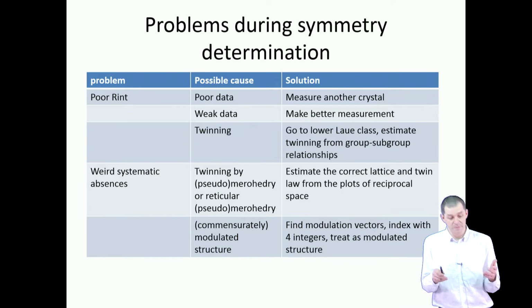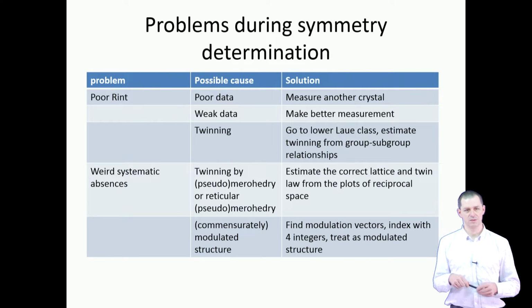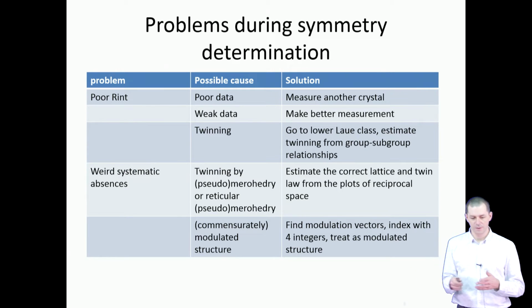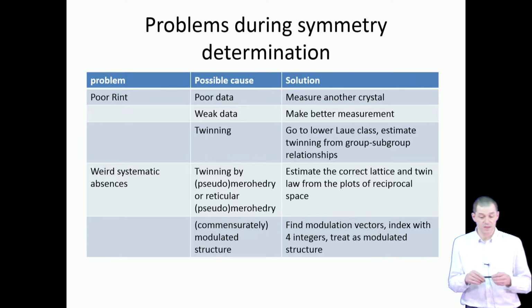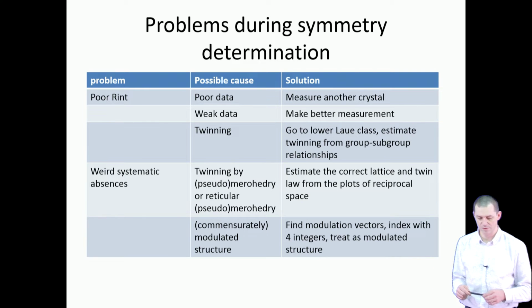Well, one cause may be the data are not as good as we might have wished, although it may have looked okay, but it just doesn't give a good result. That can happen. Then again, the solution is just to measure another crystal.